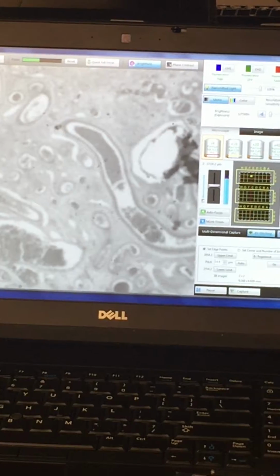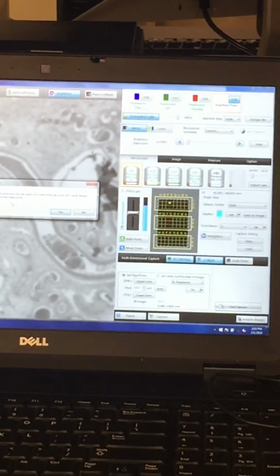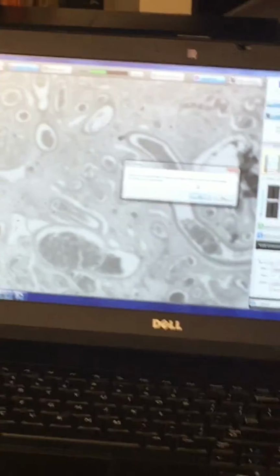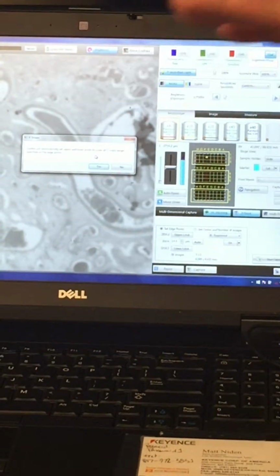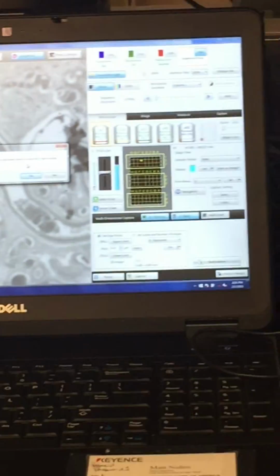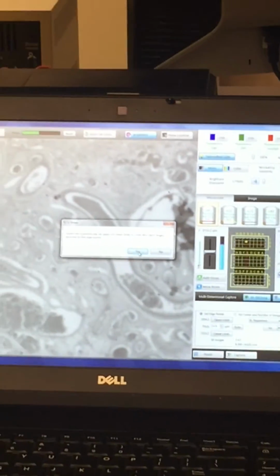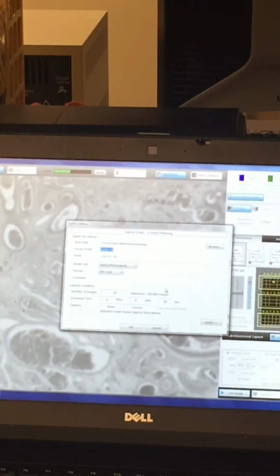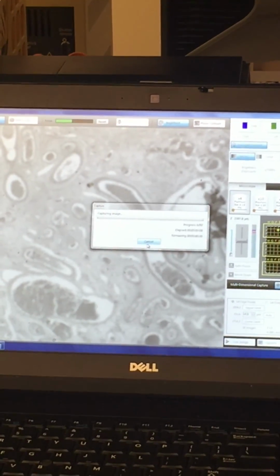You know, and again, you can use the navigation map to do this if you want to do much larger. But basically, at all of your points, set a Z-stack, and then when you go to start capture, this is right here just letting you know that it's going to switch all of those Z-stacks to the largest Z range that you selected, so that the entire Z range, XY range, everything is uniform. So then it's going to take 2 bits, so 4 images. We'll just click yes. I'm going to let this run because I'm going to give you guys a couple different options here on how to actually stitch this together. So it says it's going to take about 30 seconds.